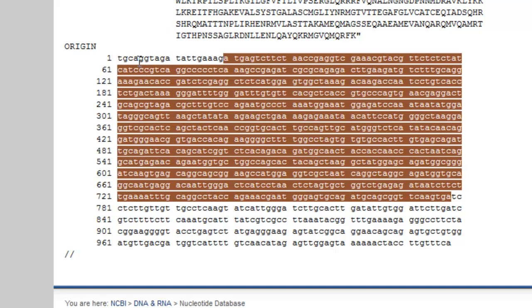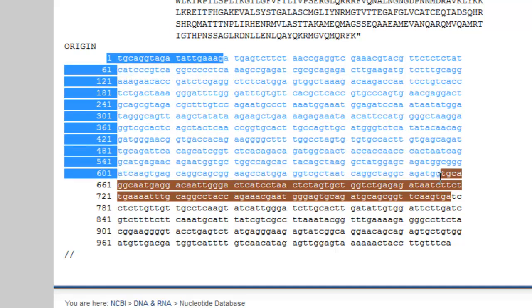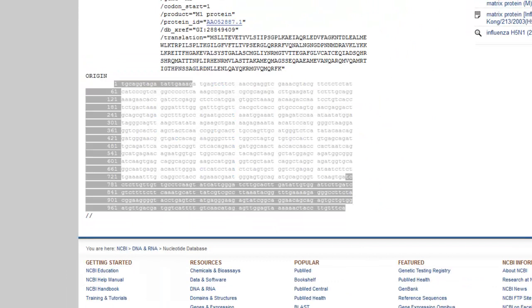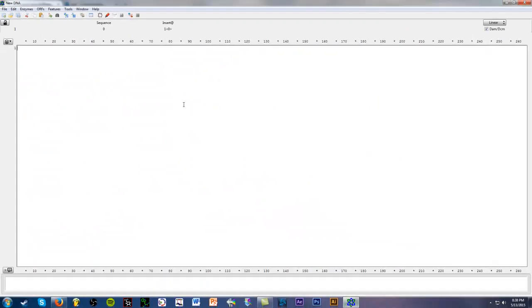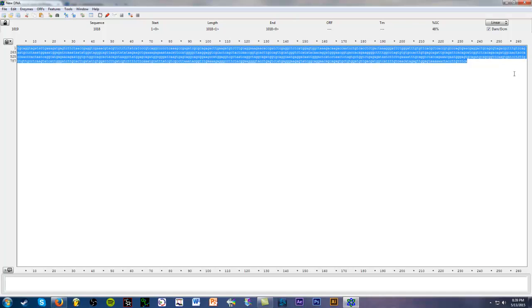So anyway, we're going to copy this entire gene sequence, not just the coding sequence. So we're going to copy everything, and we're going to just control C, and we're going to open up our APE program, and we're going to just control V to copy and paste. And that's pretty much it.